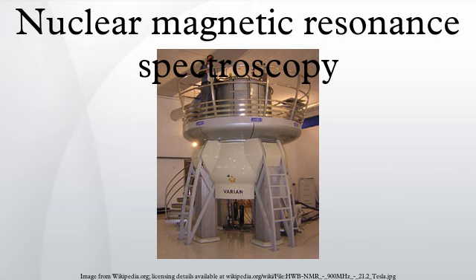However, given that the location of different NMR signals is dependent on the external magnetic field strength and the reference frequency, the signals are usually reported relative to a reference signal, usually that of TMS. Additionally, since the distribution of NMR signals is field-dependent, these frequencies are divided by the spectrometer frequency. However, since we are dividing Hz by megahertz, the resulting number would be too small, and thus it is multiplied by 1,000,000. This operation therefore gives a locator number called the chemical shift with units of parts per million.